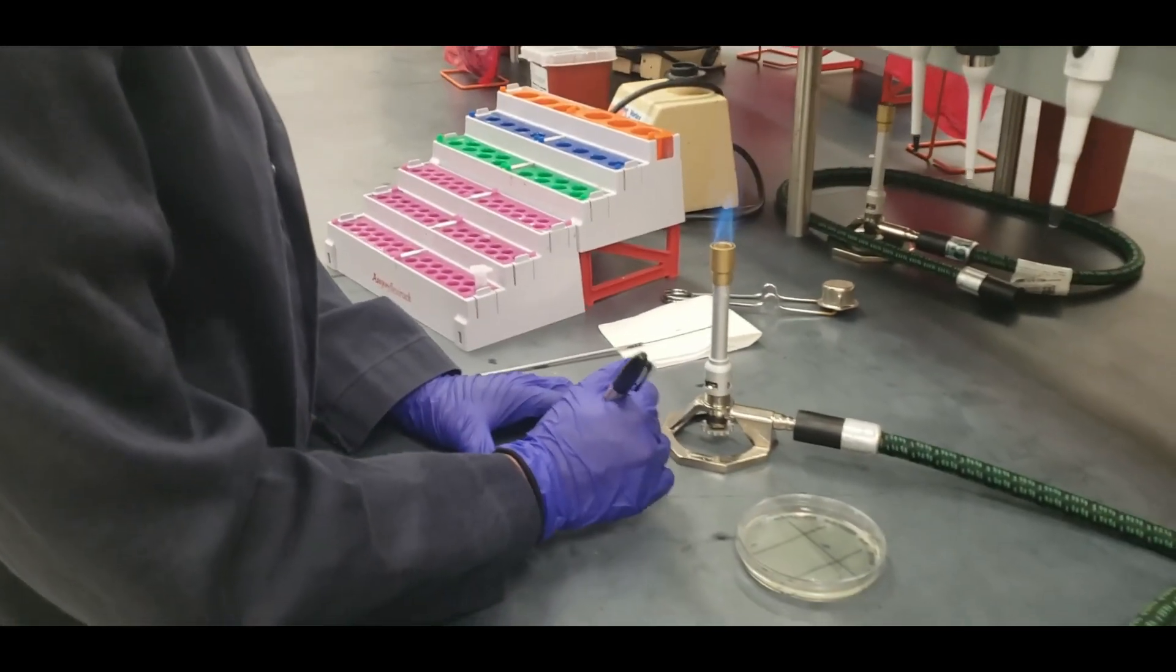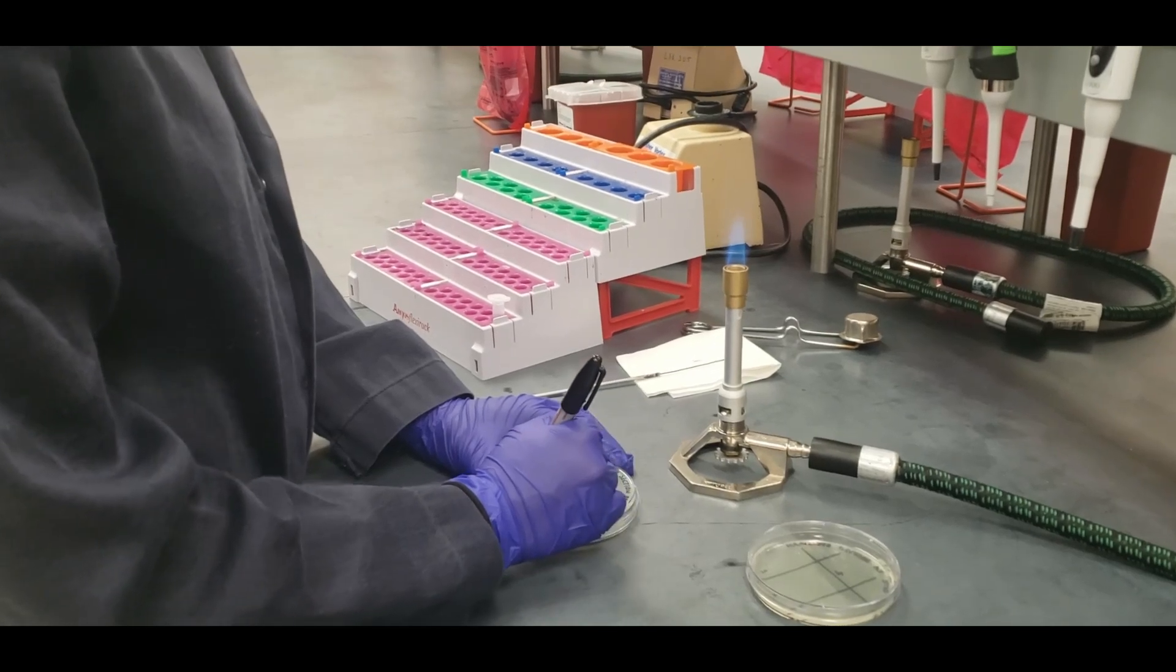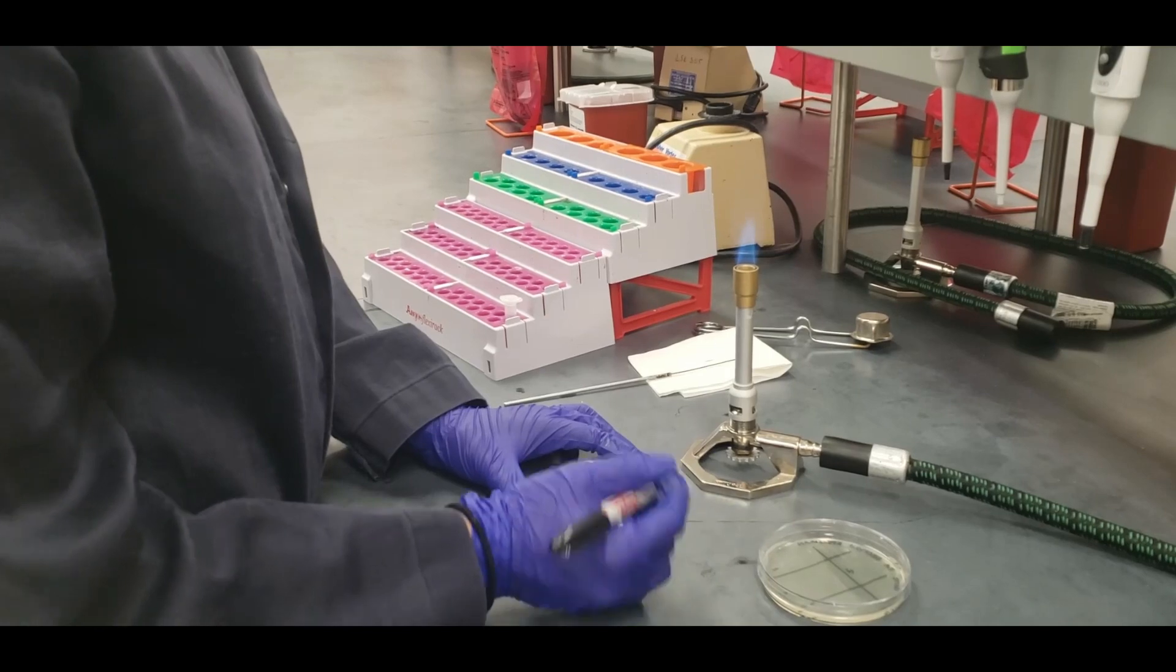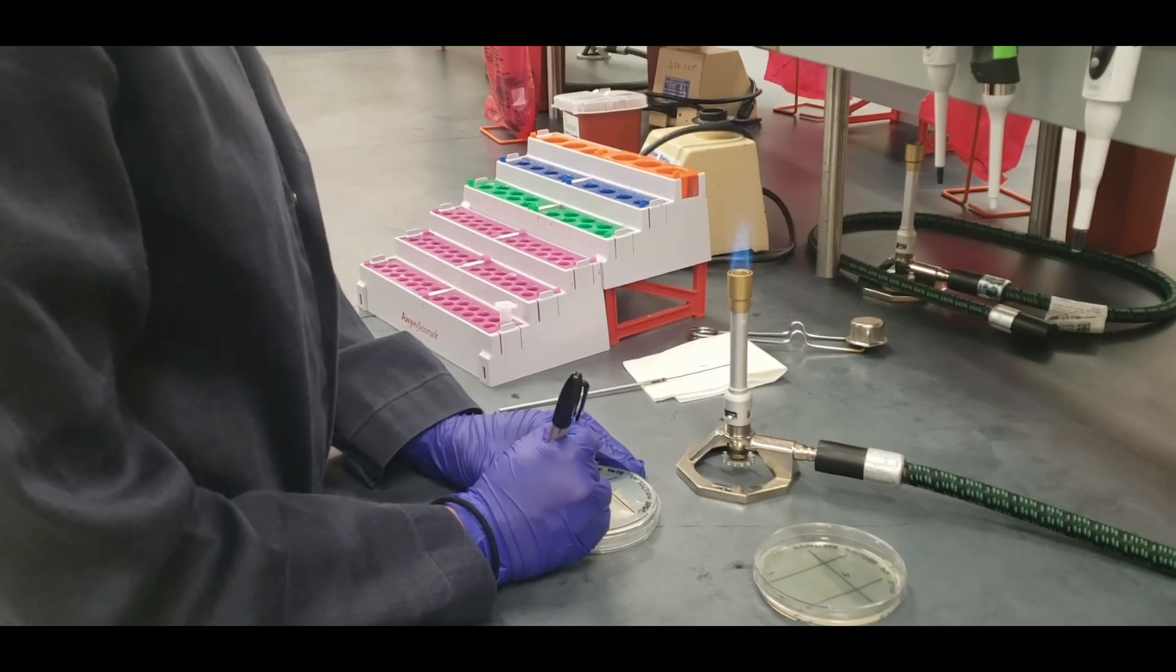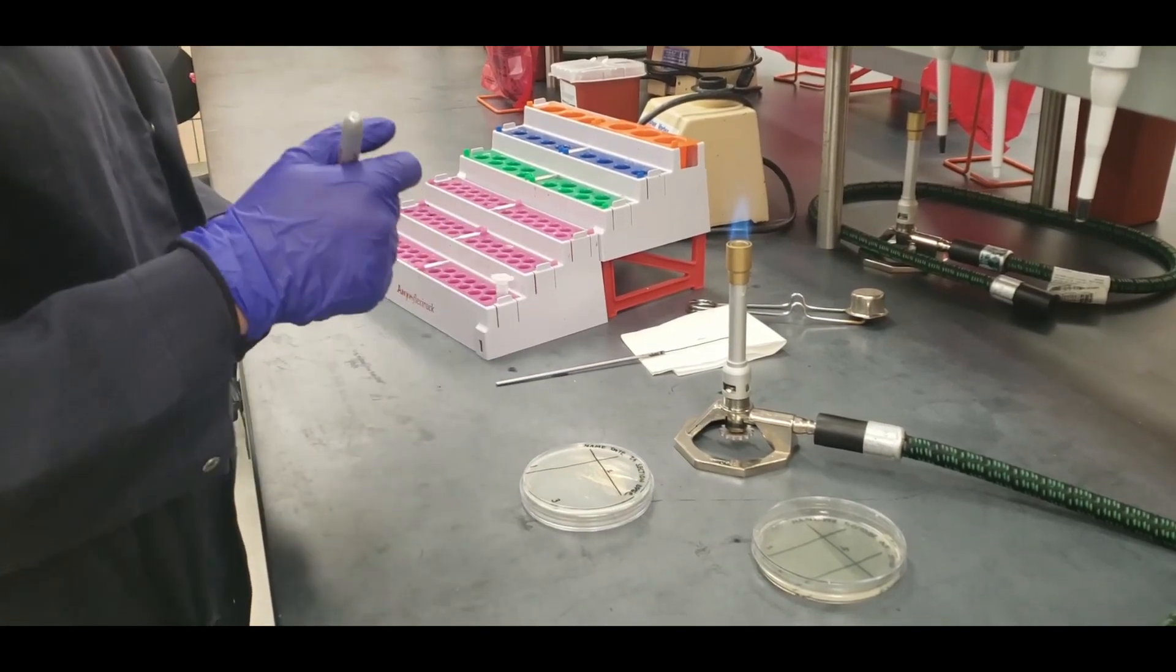Next thing, this is totally optional, but you can draw the sections on the bottom of the plate and label them 1, 2, and 3. Like I said, totally optional, but it can help you stay within the sections.